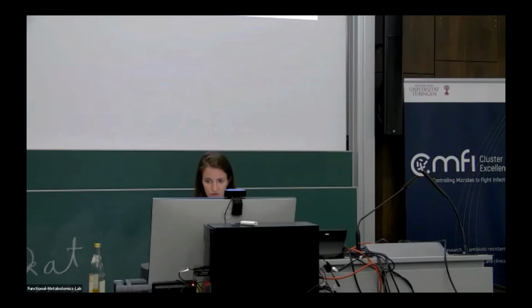We just select the job here. And basically what you will do is you go down here where it says analyze with MS2LDA. So if you click on this.